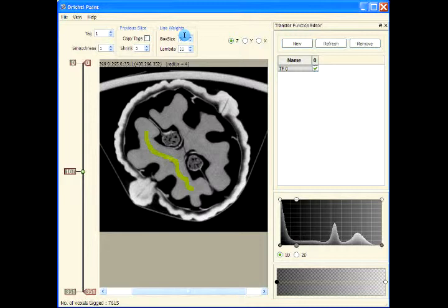So when the box size is 5, it is taking basically a 5 by 5 box, or a 10 by 10 box, to generate the average gradient information. Box size 1 is basically 3 by 3, and then you see the effect. Reset. Box size say 5 by 5, 11 by 11, and see the effect.